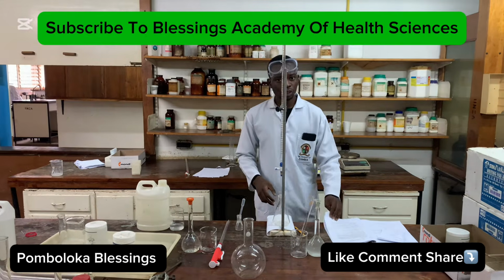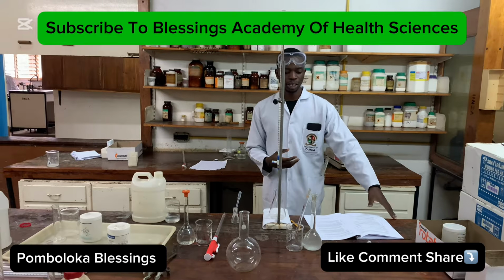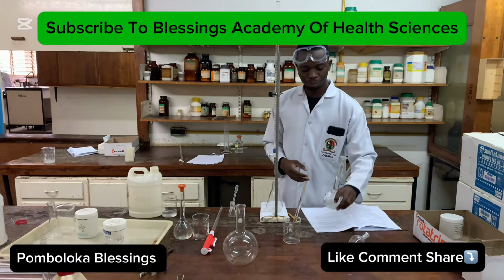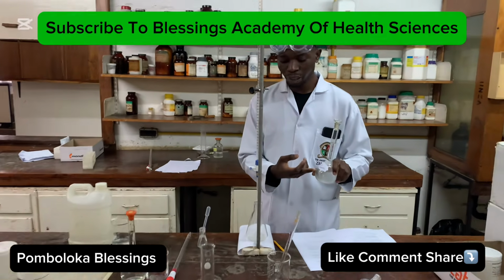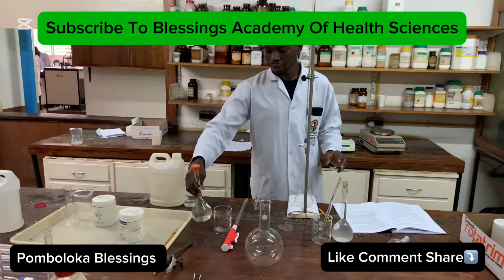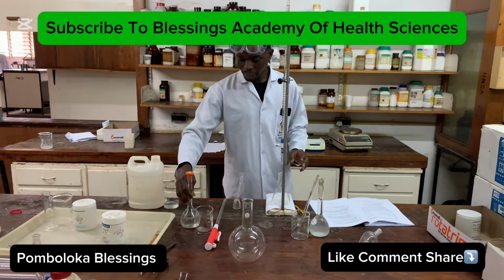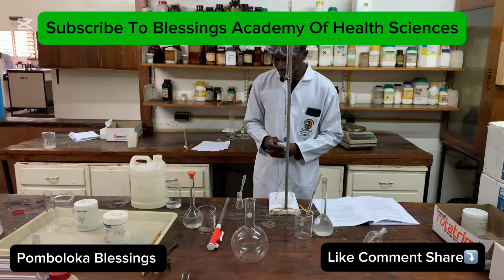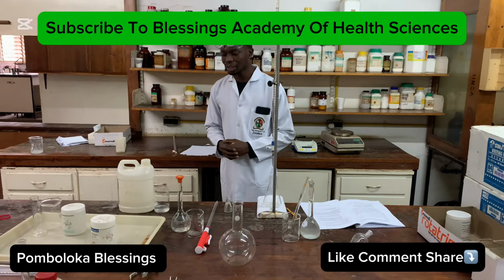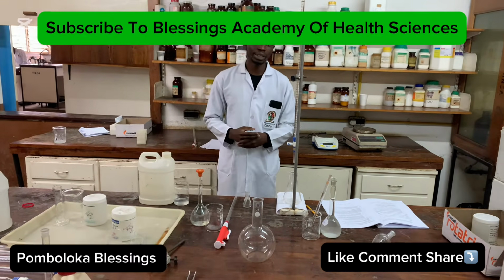And then when you get back to your lab manual, you discover that many of the reagents have been given. So we've been given ammonia here. And then the other reagent that has been given in this chemical reaction is the hydrochloric acid, or the HCl. The other part that we also need here is the indicator. We've also been given the sodium hydroxide, which we're going to use as the titrant.